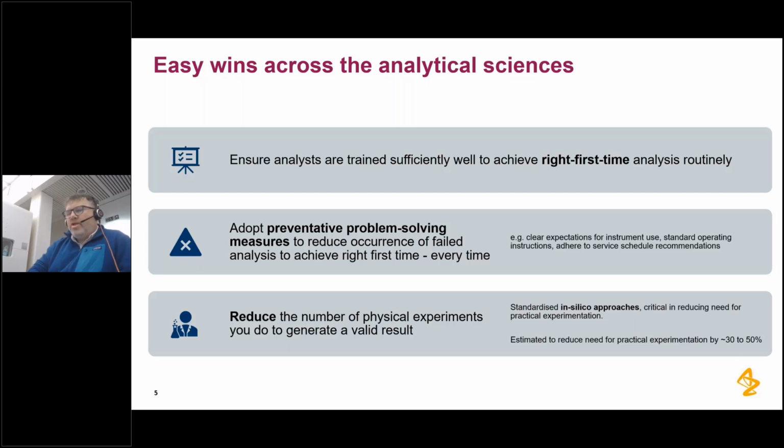And then once we can treat our instruments with care, look after them properly, and know what they're doing, can we start to reduce the number of physical experiments that we actually need to do to get that end result, and start to use the data that we're generating on a regular basis in more of an in silico way, that allows us to model and simulate chromatographic separations?